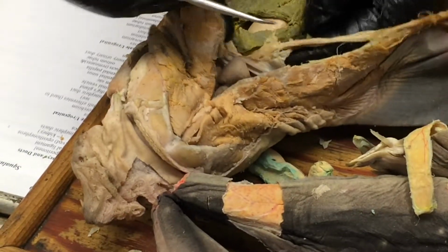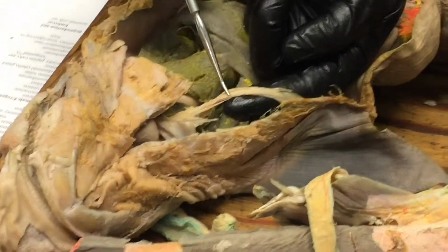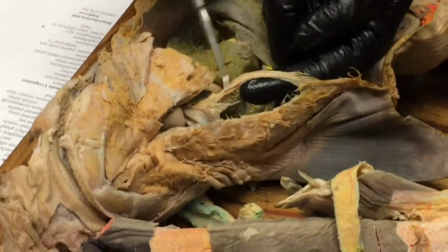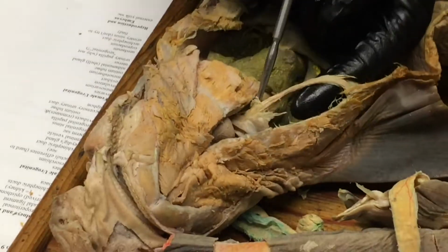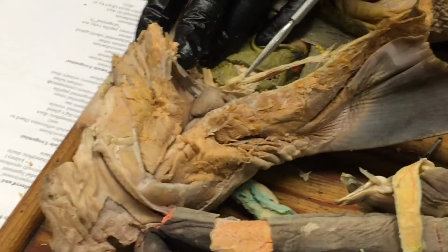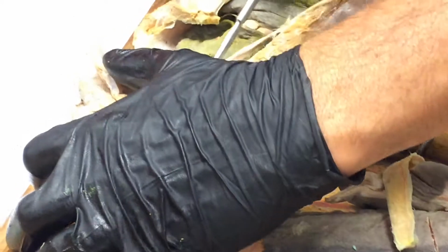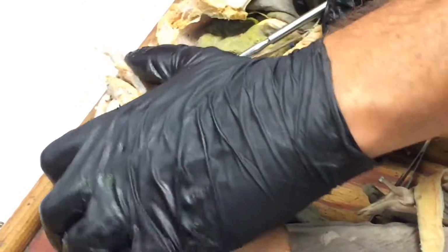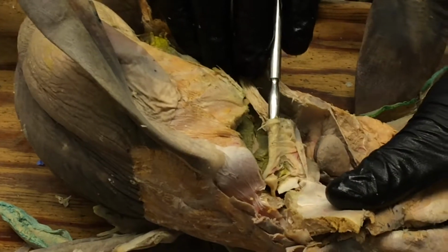So remember the falciform ligament connects the liver to the ventral body wall. So that's actually the falciform ligament that's still there. And in the free edge of the falciform ligament, there is an opening here. And that opening is called the ostium tubae, the mouth of the tubes. And if we follow that, you can see where it's going. It's coming down here into the oviduct that's running around that way. It could be left or right. So this is going into the left oviduct.